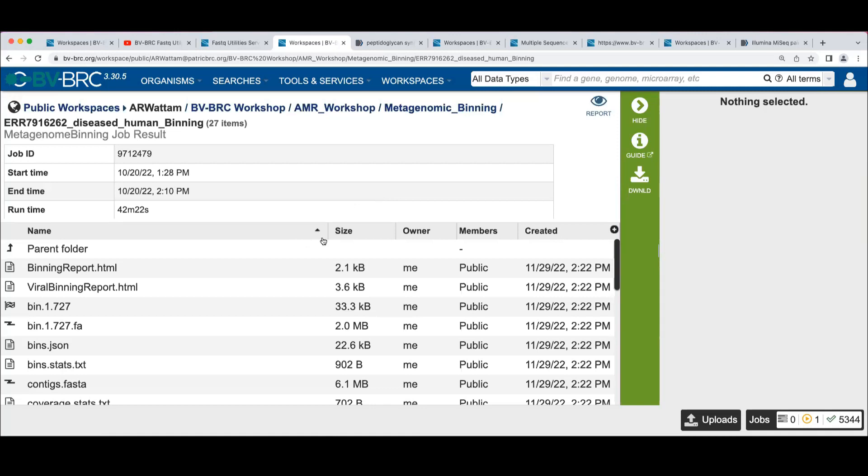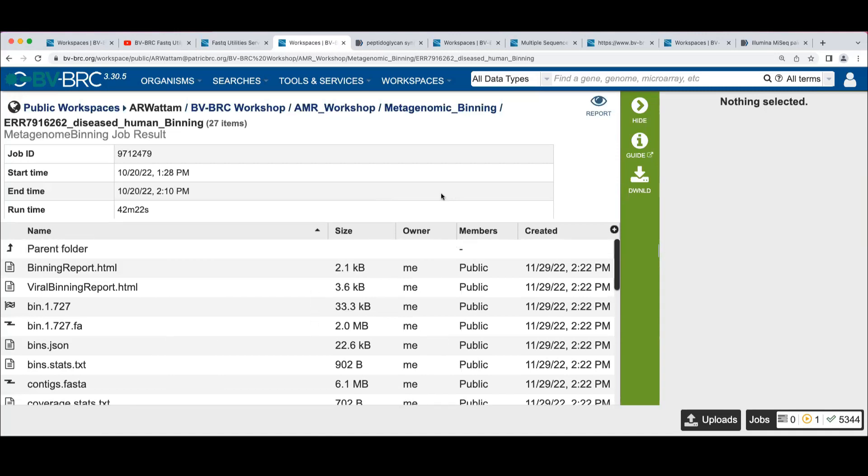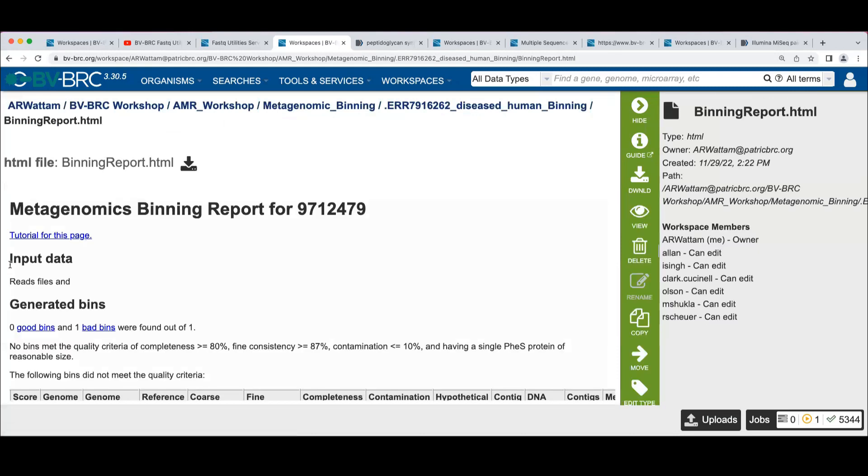Anyway, so here's our output. And again, this will probably look familiar to you. All of the job output has the same structure. And up at the top here, we've got two reports. We've got a binning report and a viral binning report. We'll start with the binning report.